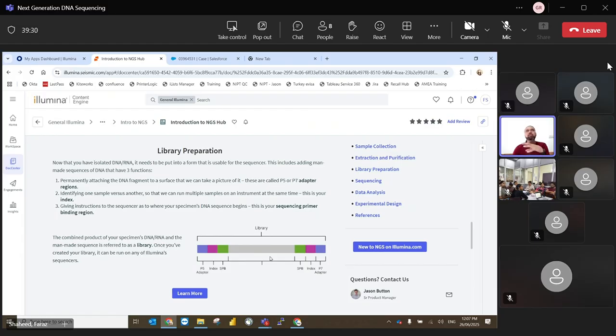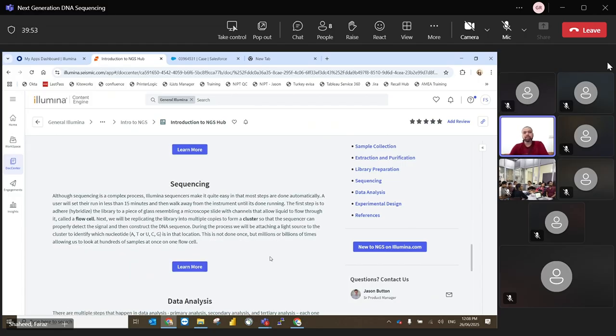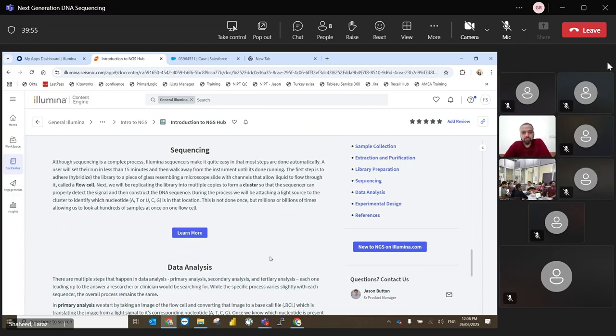Bioanalyzer. Bioanalyzer is a much more complex form of gel electrophoresis, where you can see that smaller fragments move faster, and longer fragments move slowly. So it is a more advanced or complex way of gel electrophoresis. You can study the details on the internet. It is from, I think, Agilent, the Bioanalyzer. Okay, then comes your sequencing.